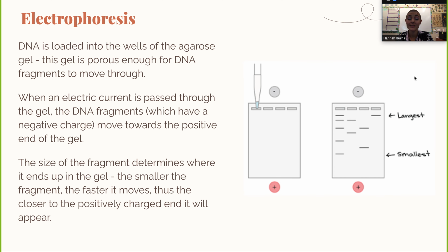So that's pretty much all the information that we need to know about electrophoresis. This is the process that we're going to be doing in class next week. This week, we're going to just be practicing with those micropipettes, getting used to taking up and dispensing out those solutions.